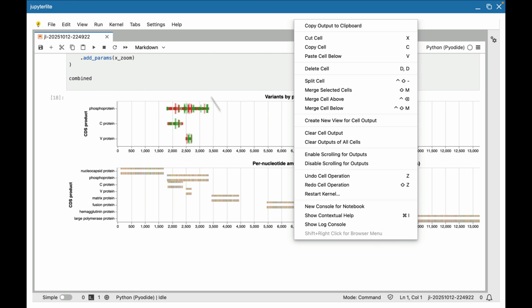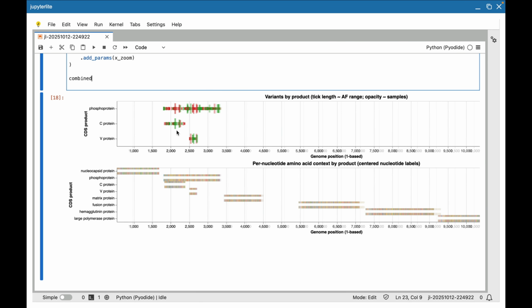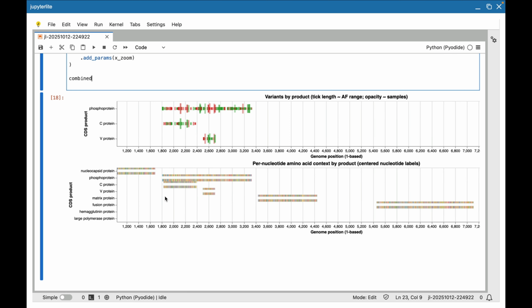The lower panel is the annotations, these positions of codons on the measles genome, just what we saw a few minutes ago. But on the top panel, we actually have variants. I filtered this down, so it's not showing variants in other genes, because in this particular analysis, I'm only interested in things which are within the overlaps. So let's zoom in.